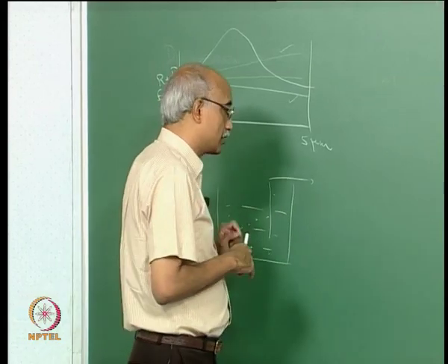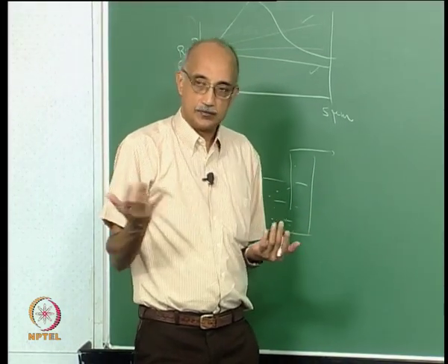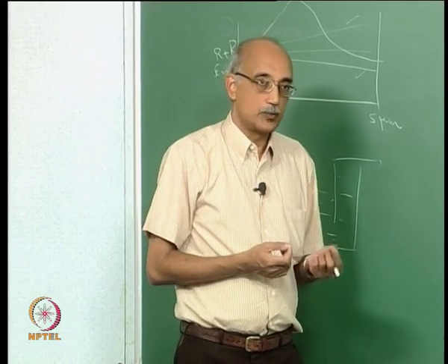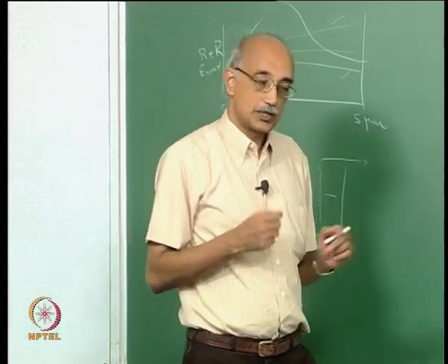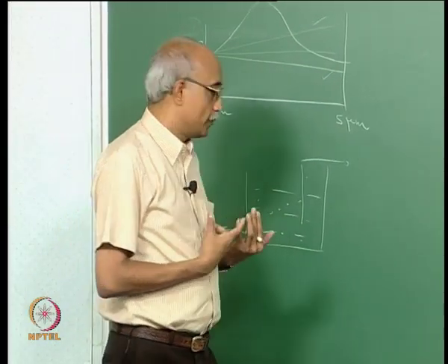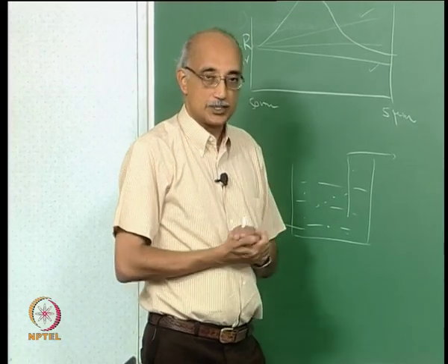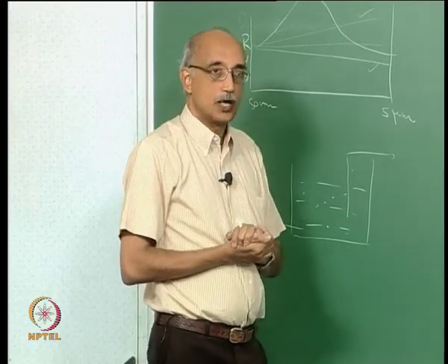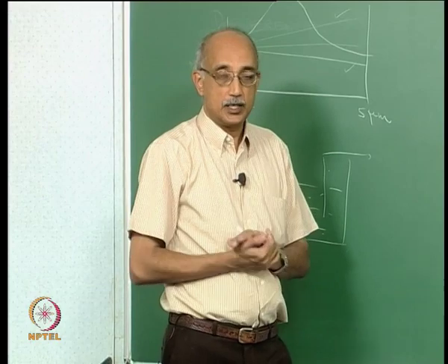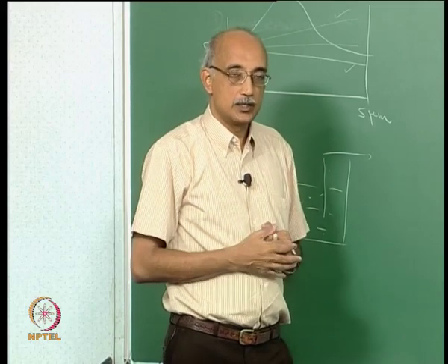Now this is an important characteristic because if your sample is not well stirred, well mixed and stable, then the uniformity is going to be very poor. So for example, one of the challenges in dealing with nanoparticles is the tendency to agglomerate. So you may find that in the case of particles that are highly mobile within the suspension, there is quite a bit of non-uniformity in your sample because of the tendency to form localized clusters of particles. So that will be an indication that you have to use some stabilizers to keep the particles in position in the solution before you start doing size and count measurement.